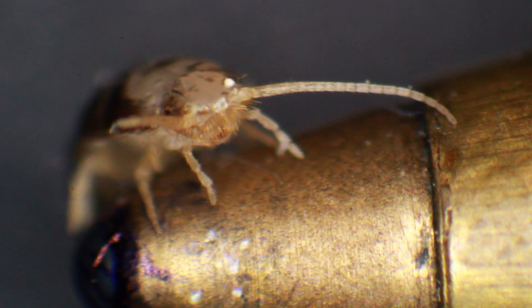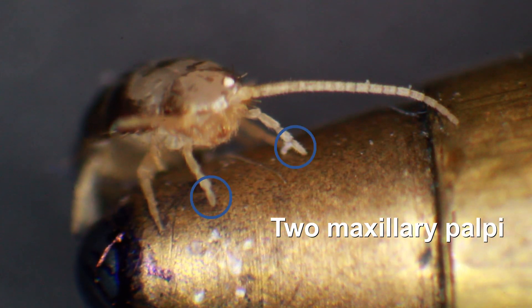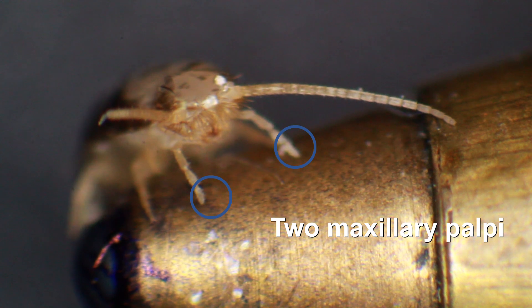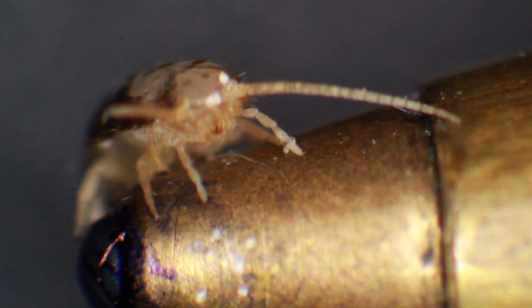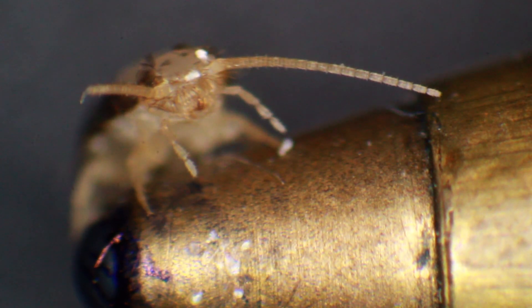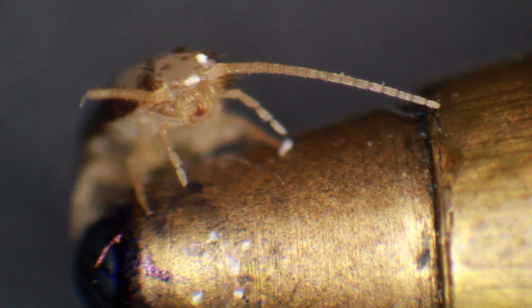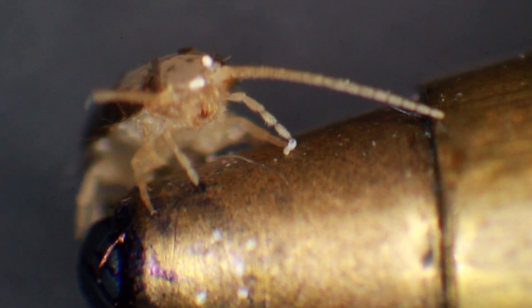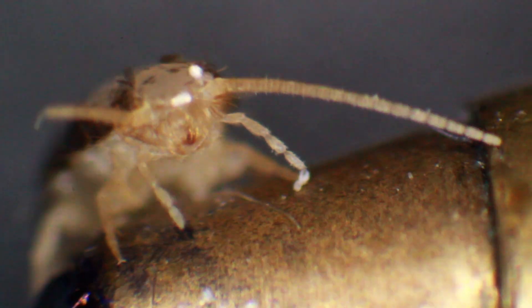Now you can see much better the two maxillary palpi. You can also see that one of the antennae is a little bit shorter - it's probably broken off. The maxillary palpi don't have any claws, and they are so long in a silverfish that I confused them with legs. I was actually hoping I had made a big important discovery - the first insect with eight legs! Of course, that's highly unlikely.